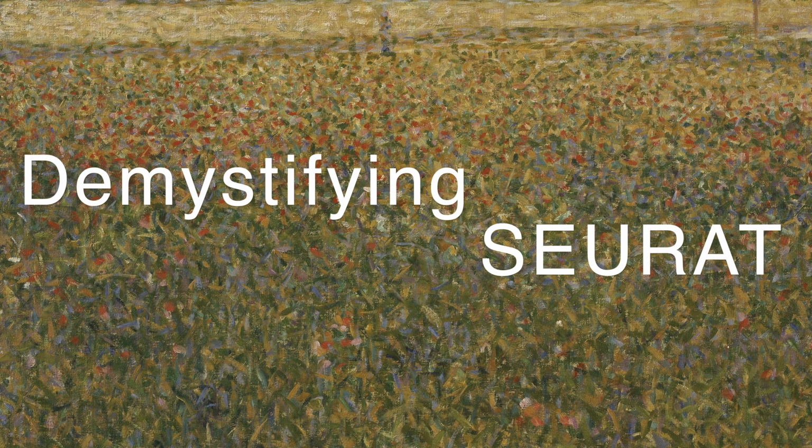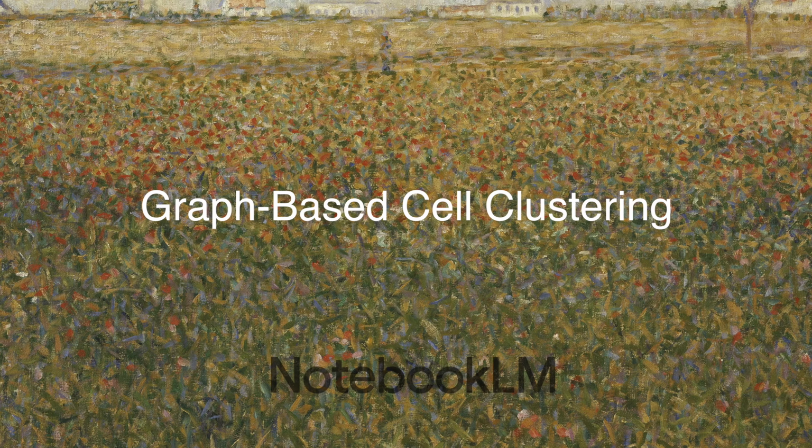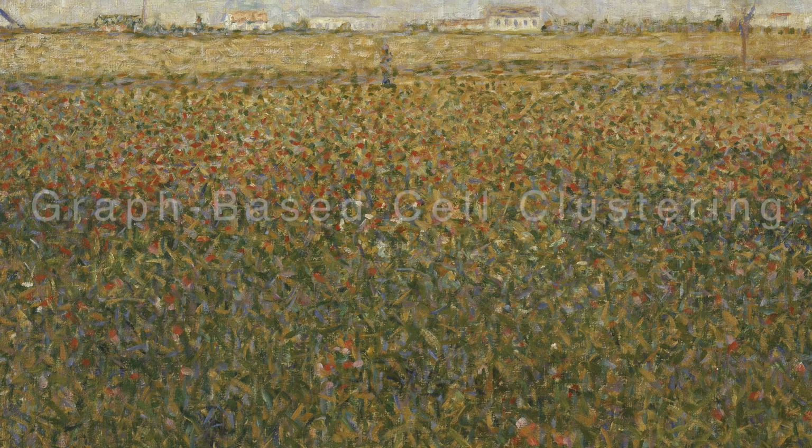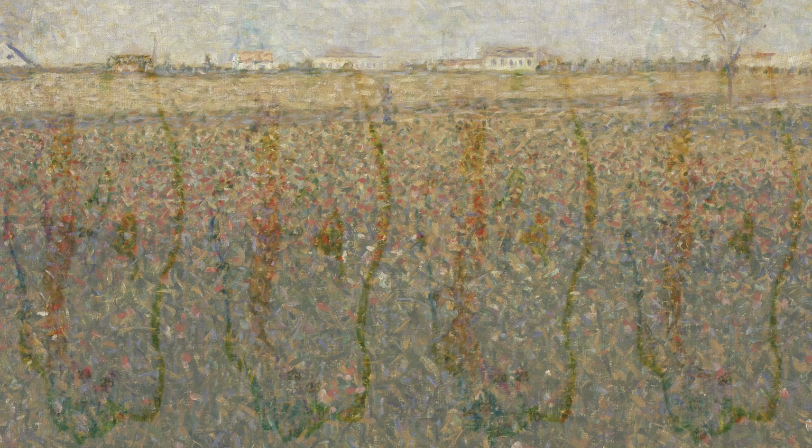Hey everyone, and welcome. So if you've ever stared at a single-cell dataset, you know that feeling, right? It's just this massive universe of information, and it can feel like pure, beautiful chaos. Today, we're going to demystify one of the most important steps in making sense of it all, how the Seurat toolkit uses this really smart graph-based clustering to help your cells find their true biological cliques.